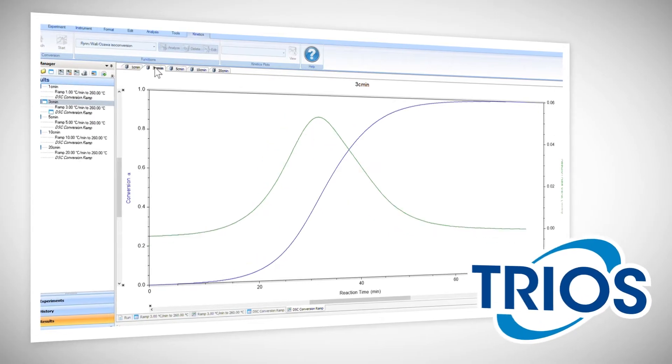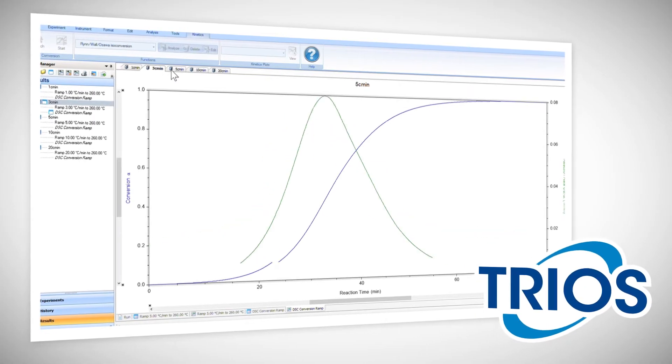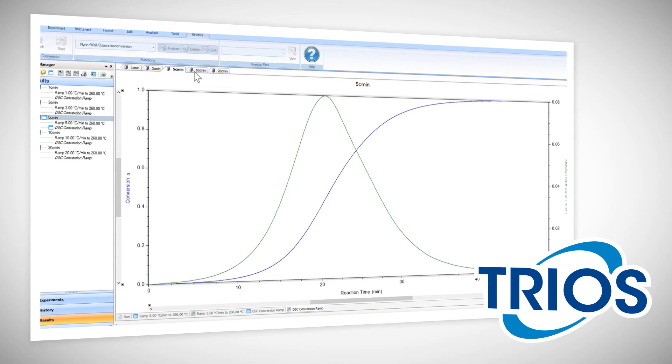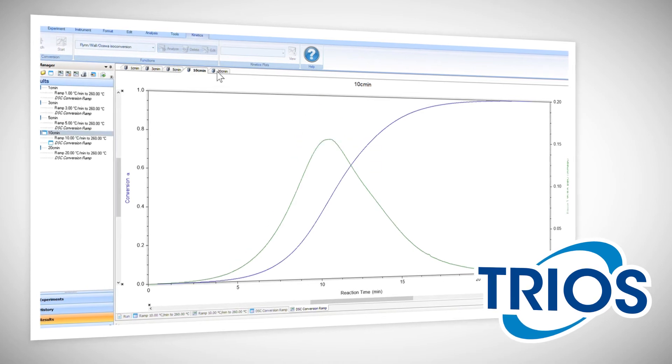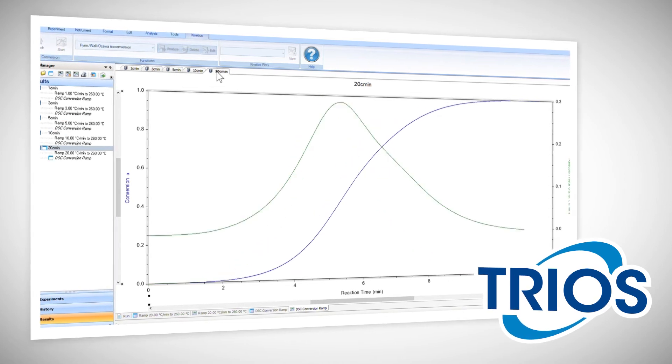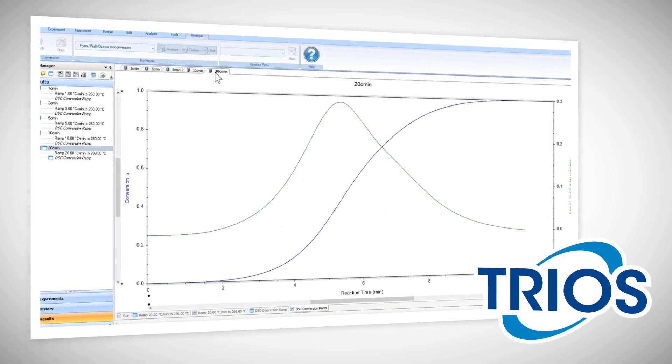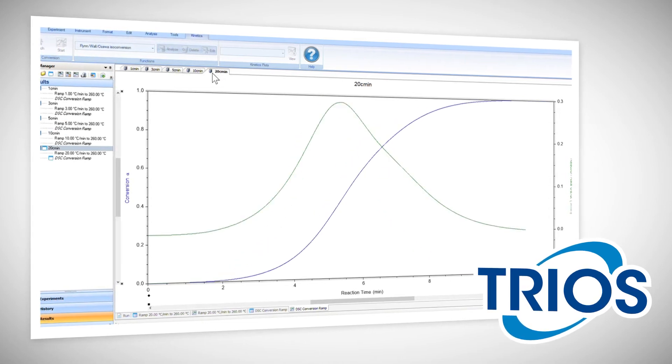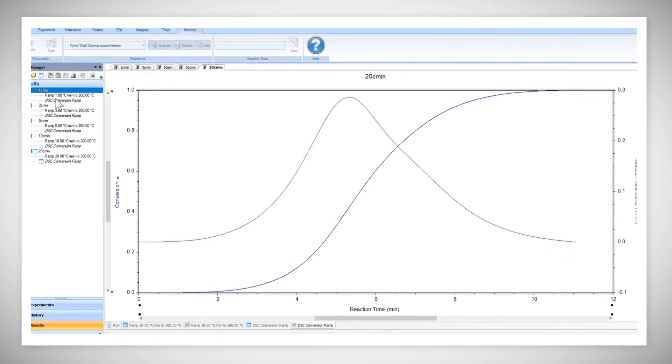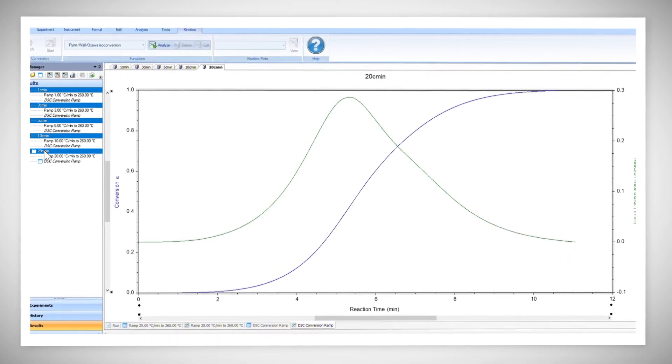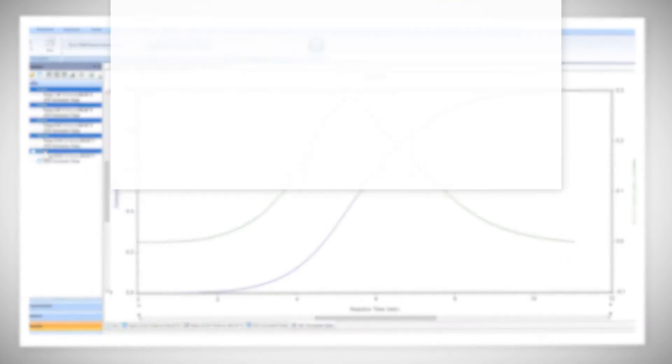This video will focus on the kinetics features used to analyze DSC data, but the workflow is very similar for analyzing TGA data. The TRIOS Kinetic software contains a variety of kinetics models for different types of analysis.